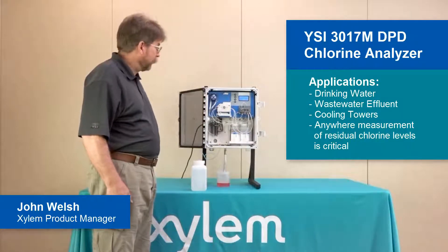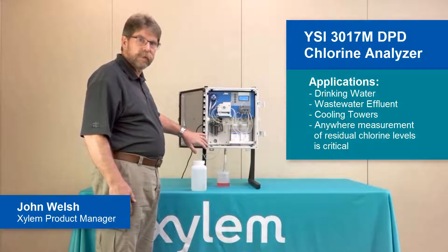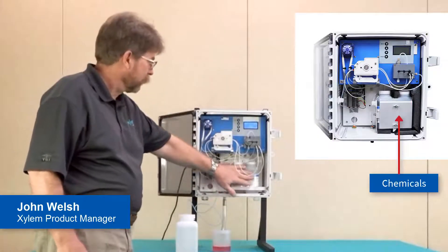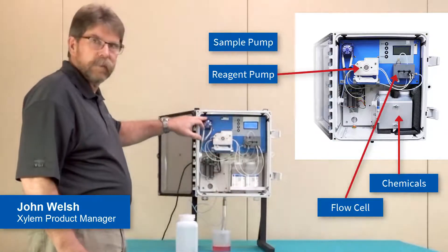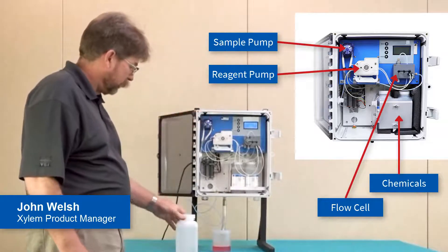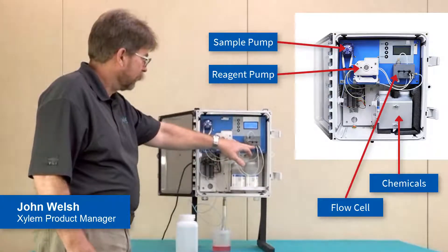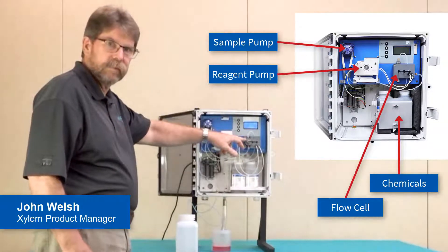This covers any application where the measurement of residual chlorine or chlorine levels is critical. The model 3017 utilizes the flow injection analysis technique for the determination of chlorine. What we see here are two reagents — the DPD indicator and buffer reagent — the flow cell, reagent pump, and sample pump. In order to make this analysis, the sample pump will pull a sample, shown here in this bottle, through the flow cell, where the reagent pump will mix the reagents inside the flow cell and then through the actual analysis cell to make the measurement.